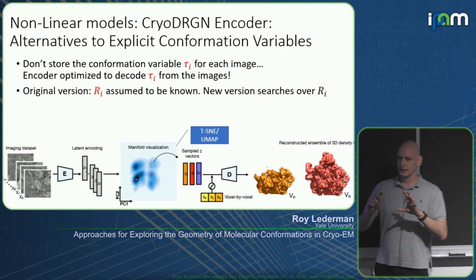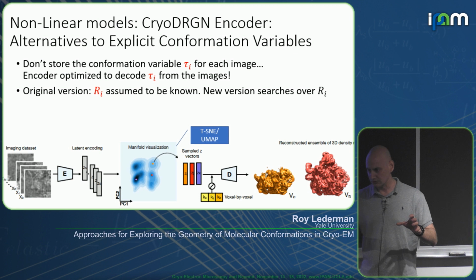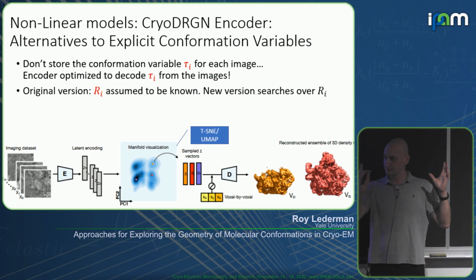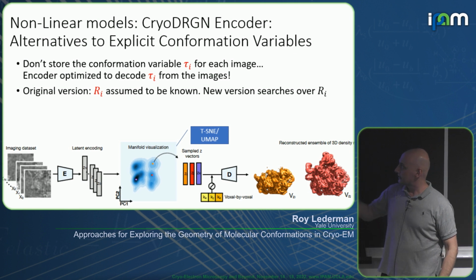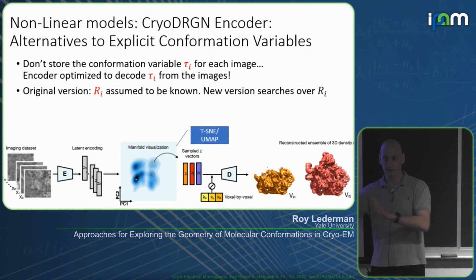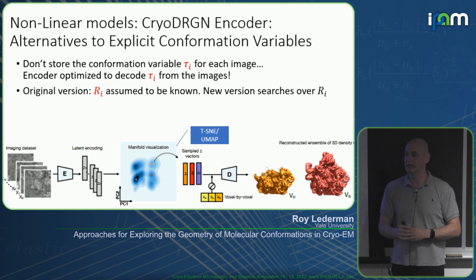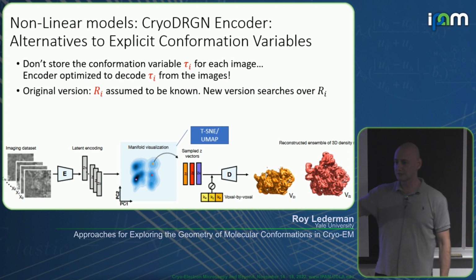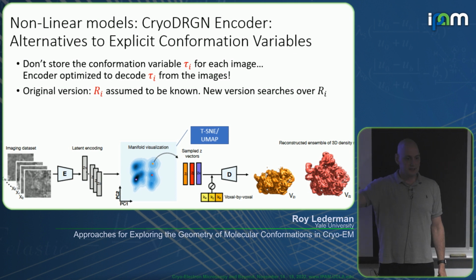The other thing, so it's a variational autoencoder architecture. So it has these two components. One is the decoder. So that's what I call the hypermolecule. It's a different way of implementing it. The other innovation is the encoder. In the old days, the way we used to think about all the latent variables is that we're trying to estimate them.